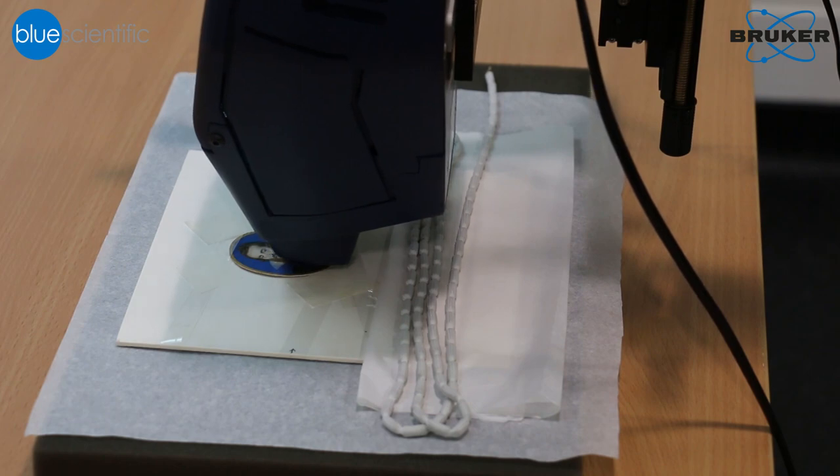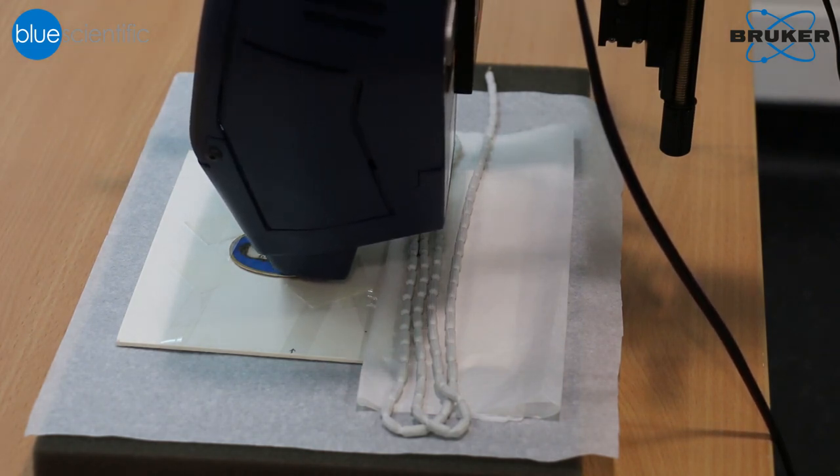One of the beautiful things about x-ray fluorescence is that it does not only give us surface information, because the x-rays penetrate through the paint layers all the way down to the parchment. So we can get information about the whole stratigraphy of the object we're looking at, from the parchment substrate all the way up to the upper paint layers.